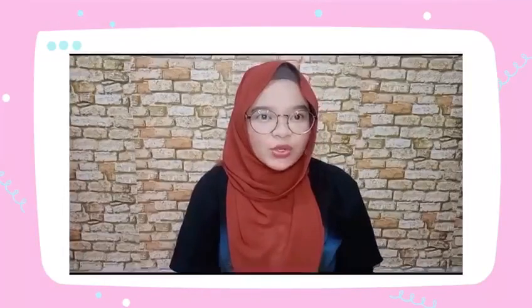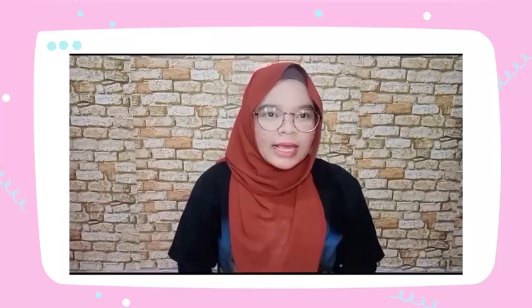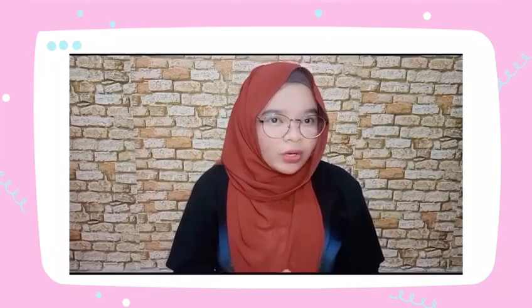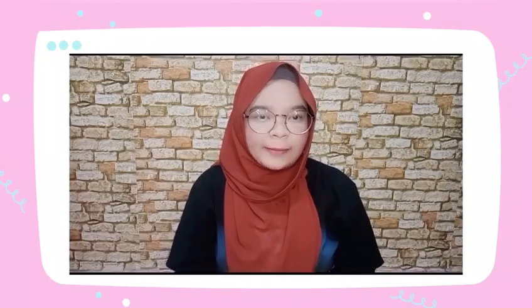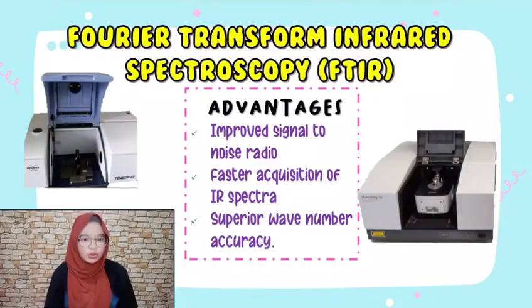Okay, the next instrument is the Fourier transform infrared spectroscopy. It is also known as FTIR. A pyroelectric detector is used in this instrument as it has fast response time. FTIR spectroscopy is used to verify the origin of potential microplastic particles from synthetic polymers.